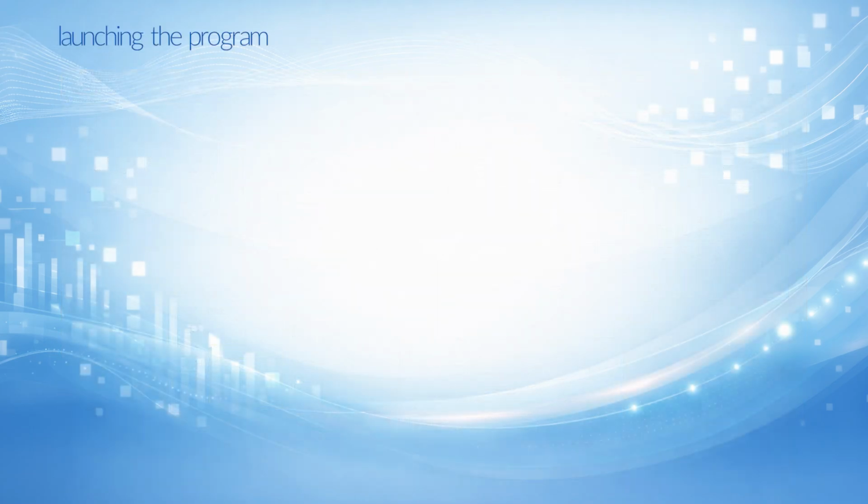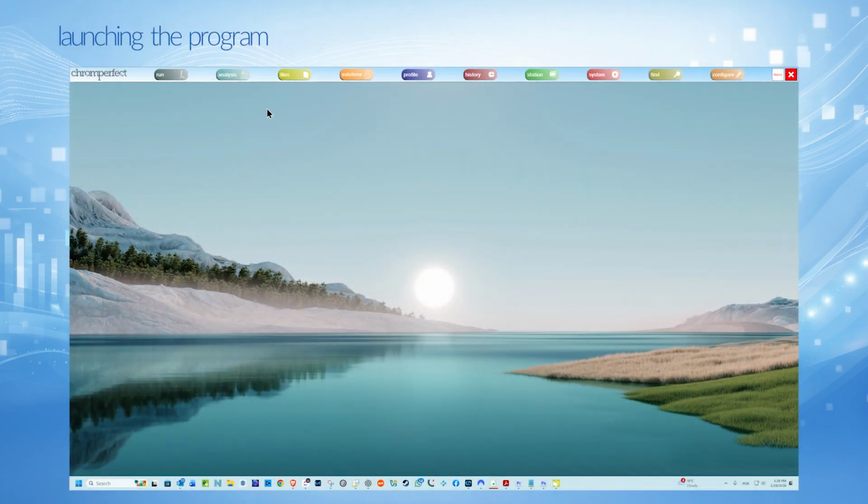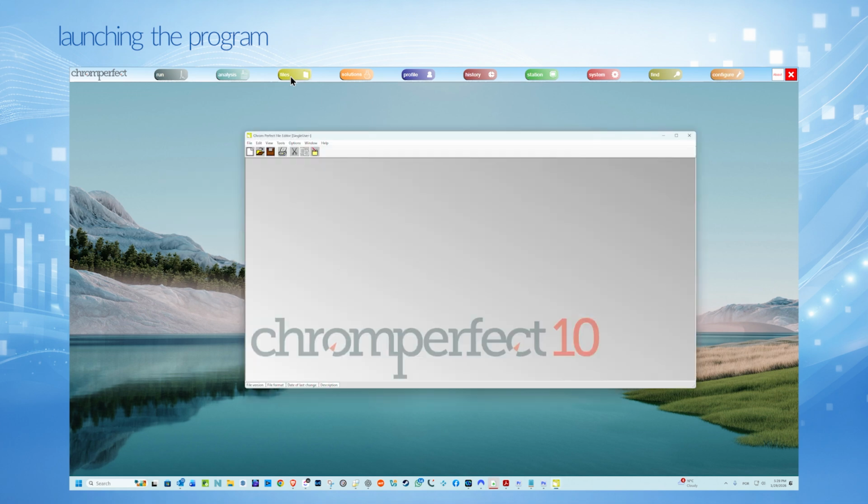Launching the file editor. To launch the file editor, click the Files button on the Chromperfect main menu. When the file editor opens, the main form may appear empty. This happens if the open dialog has been suppressed.